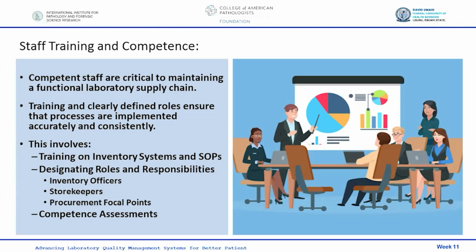They must receive regular training on inventory software, because if you're using a digital inventory system and the staff don't know how to operate it, it's going to be a very big challenge. They should know how to operate the digital platforms. They should know how to use the manual logs as well. QMS documentation practices is another area the staff should be trained on.